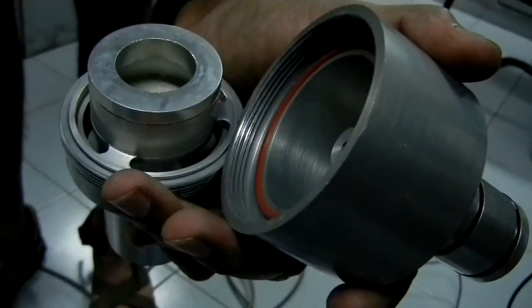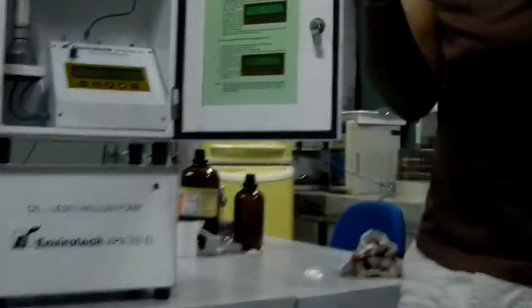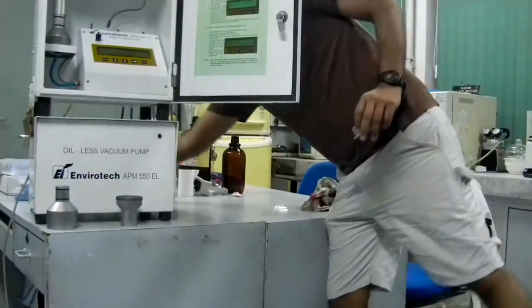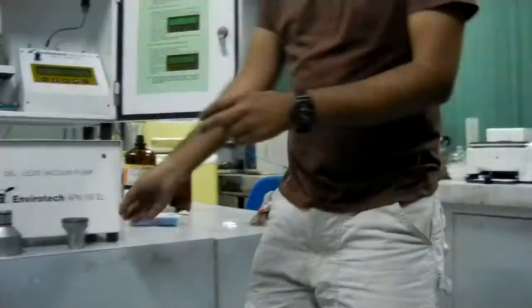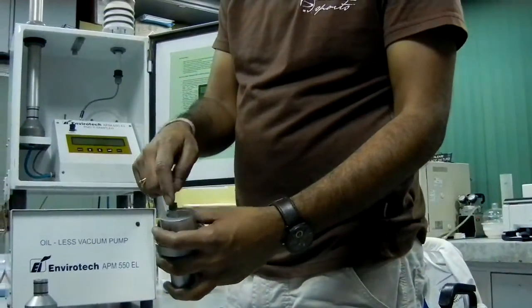The gas containing particles less than 2.5 microns will pass through and exit from this portion, getting collected on the filter paper. We need to change this 37mm filter every time we do sampling. Let me show you how to change the filter paper.